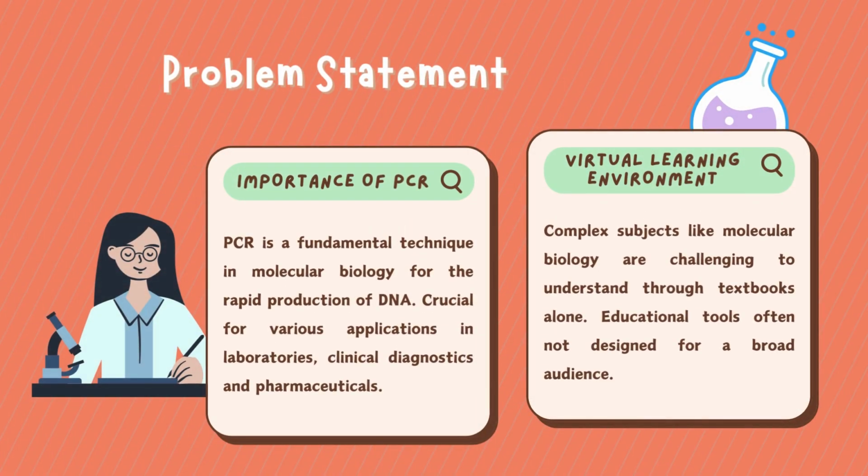So why we focus on PCR? This is because PCR is essential in molecular biology, where it is used in various applications like clinical diagnosis. Besides, its complexity makes it challenging for a broad audience to understand through text.